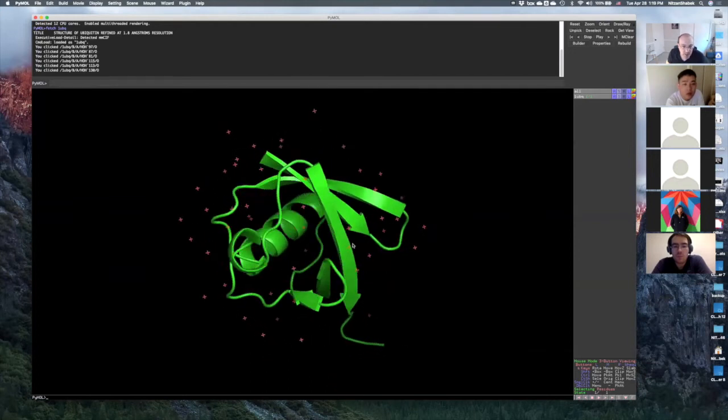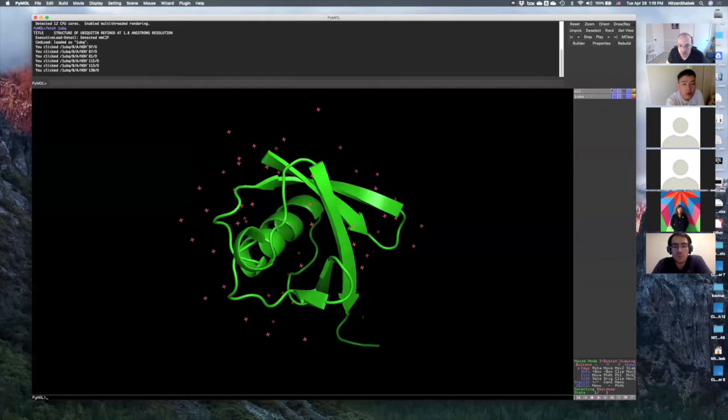Just to make it clear. So now I want to show you this panel here. And in this panel, you see A, S, H, L, and C, okay? The A means action. So when I press that, there are different actions that I can do. The S is show, what do you want to show, okay?